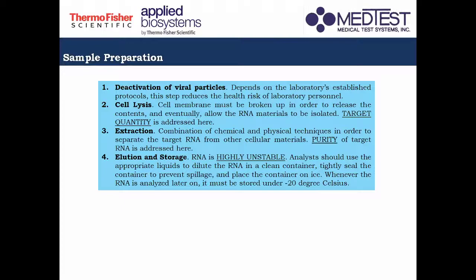And then the last concept is the elution and storage. Now, RNA is a very unstable molecule. So, gaya ng sinabi ko kanina, RNA is a biopolymer, no? So, since it's a biopolymer, it's a fairly big molecule, but it's very unstable. So, in the presence of undesirable conditions, RNA will tend to degrade or break down.